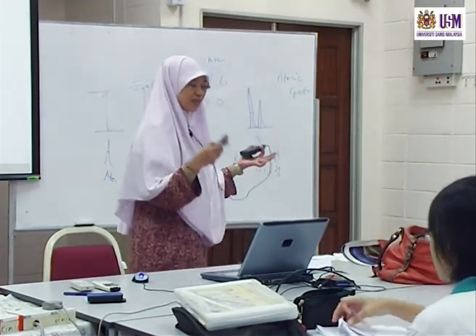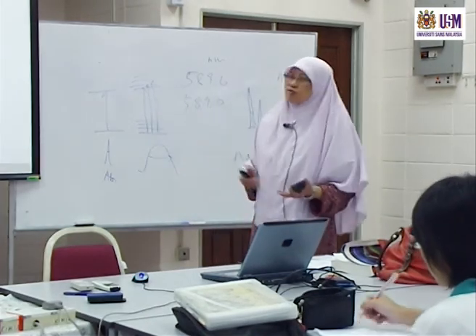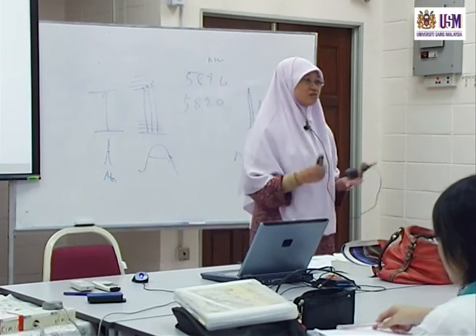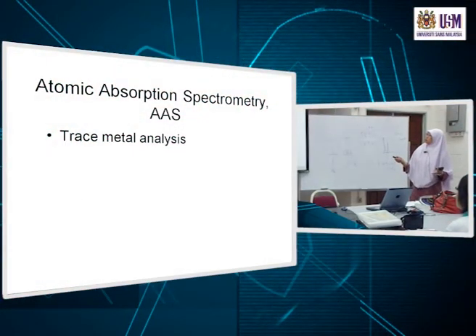So any questions with that intro? Basically, we've gone through all those things before, all those energy level diagrams, etc. So now we start with our first technique, atomic absorption spectrometry.